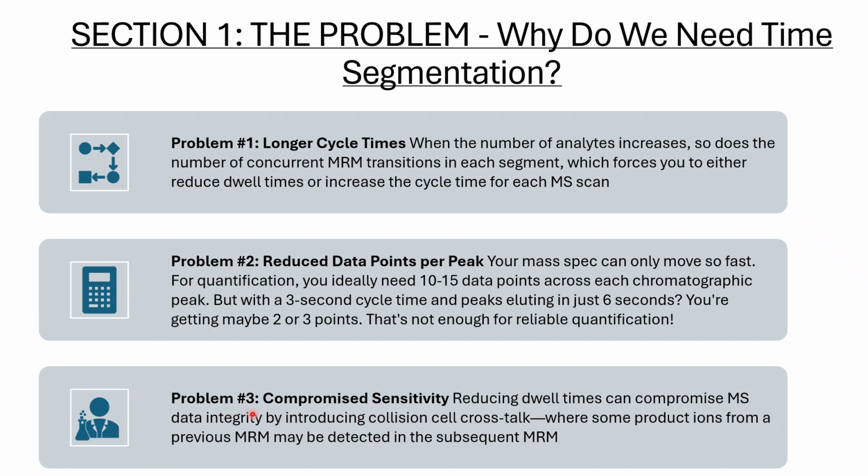Problem 3. Compromised sensitivity. Reducing dwell time can compromise MS data integrity by introducing collision cell crosstalk, where some product ions from a previous MRM may be detected in the subsequent MRM.